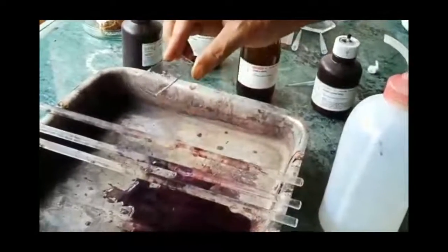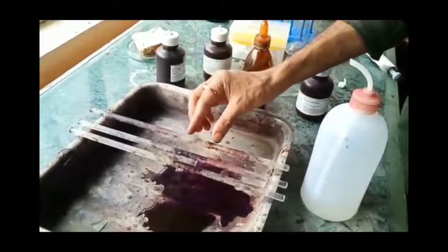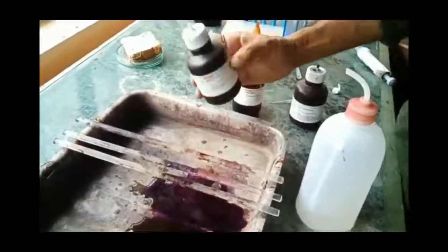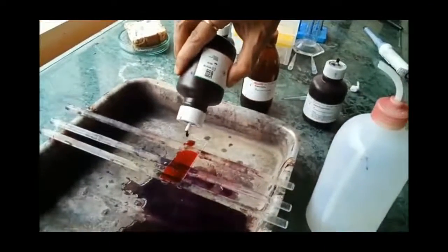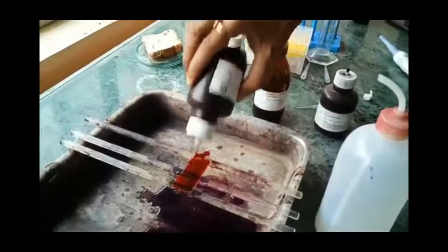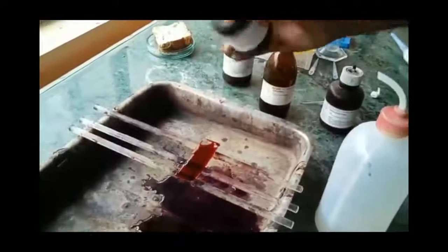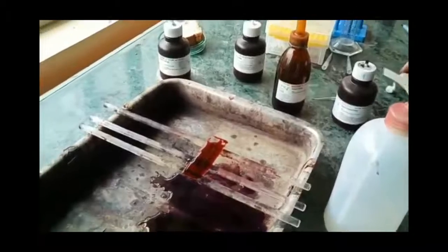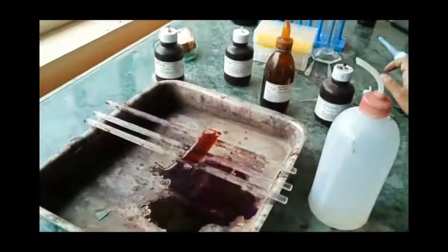After gently rinsing with water, we will cover the smear again with safranin, and then we will let the safranin stay over the smear for 30 seconds. Once 30 seconds is over, we will gently rinse the stain with water.